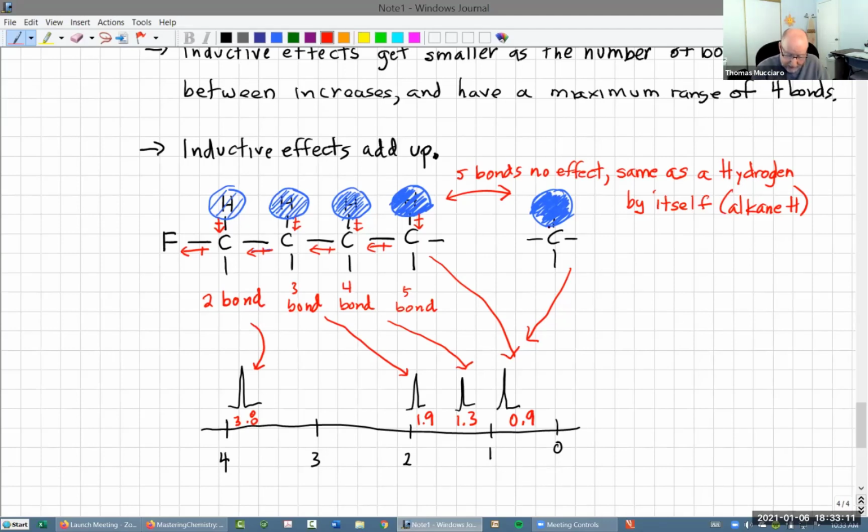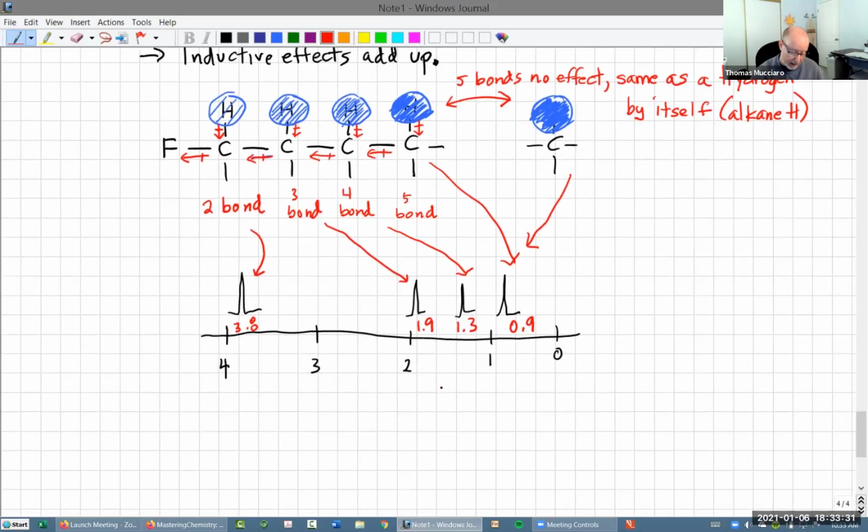Do you see as the density increases, it moves farther and farther to the right. And when we look at the correlation table, that's where those numbers come from, basically. Everybody cool with that? So there's tables of these things, right? And I'm going to have to put the correlation table.